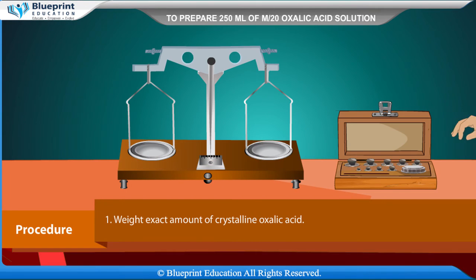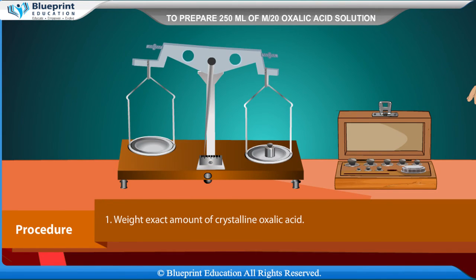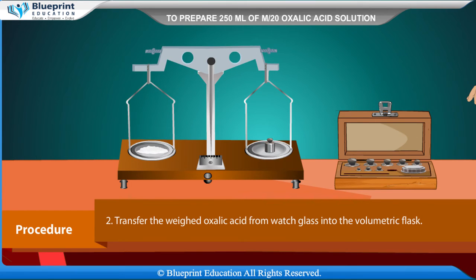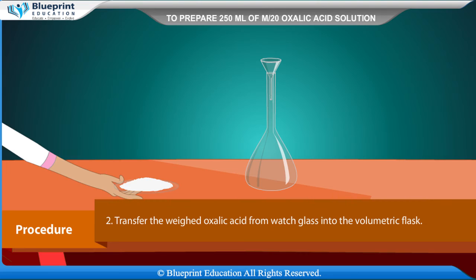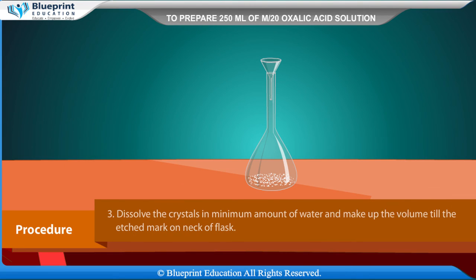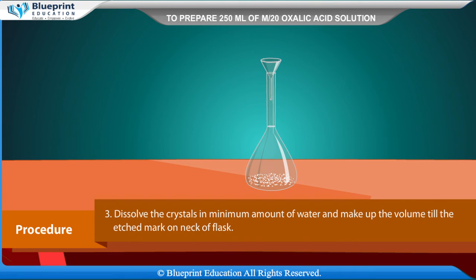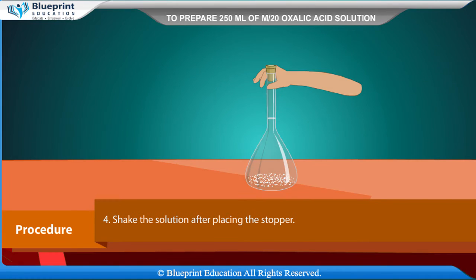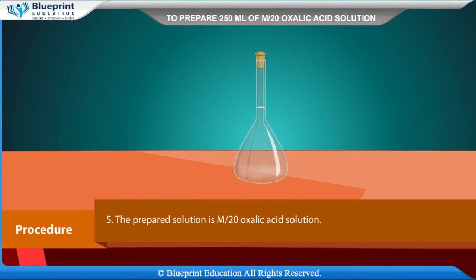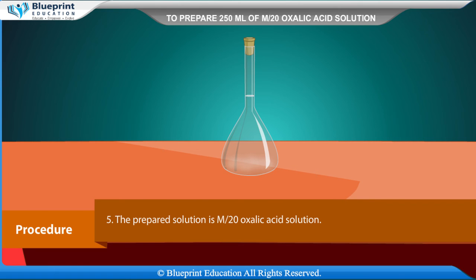Procedure: Weigh the exact amount of crystalline oxalic acid. Transfer the weighed oxalic acid from the watch glass into the volumetric flask. Dissolve the crystals in a minimum amount of water and make up the volume till the etched mark on the neck of the flask. Shake the solution after placing the stopper. The prepared solution is M/20 oxalic acid solution.